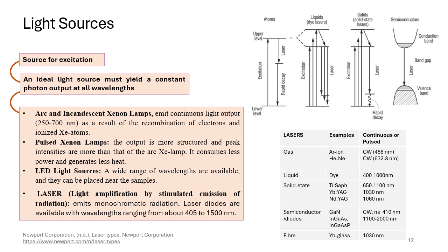So these are the types of lasers that we use in general, and I have also mentioned here whether these are continuous or pulsed ones.